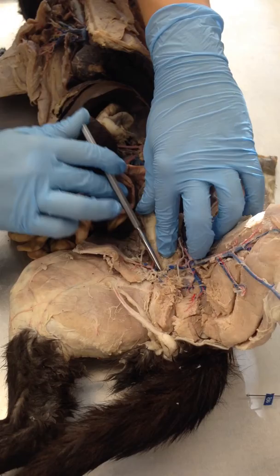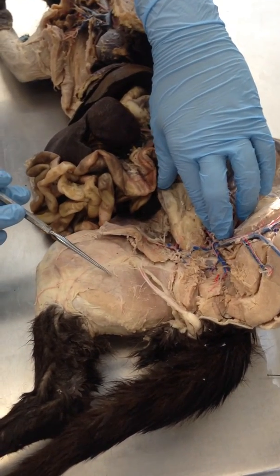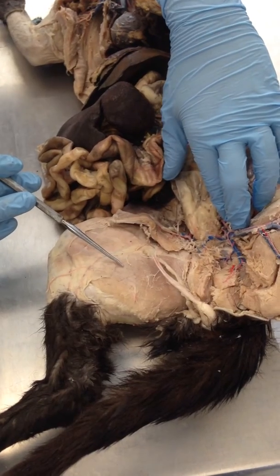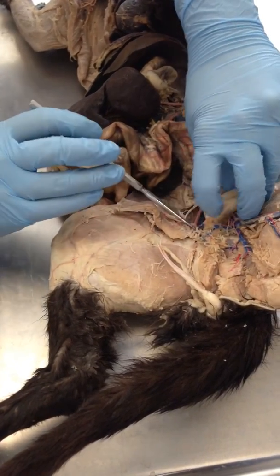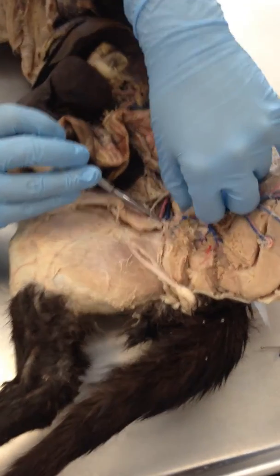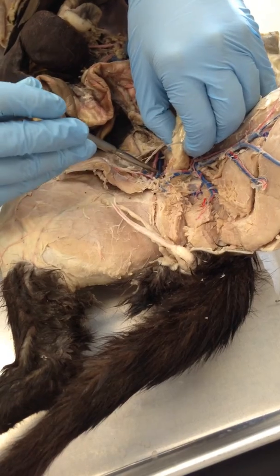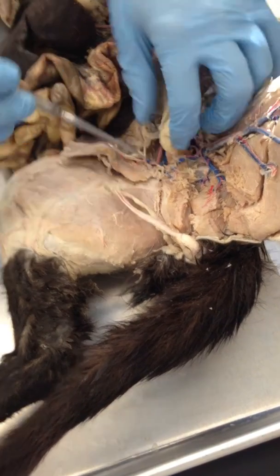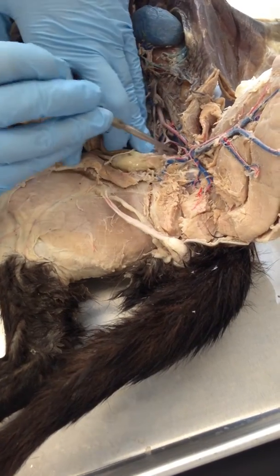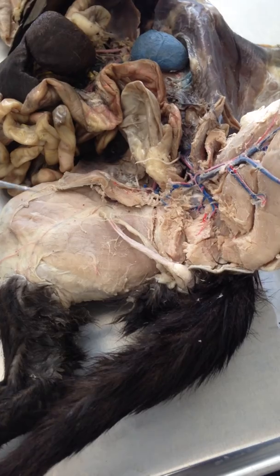Do we need to cut this open so we can see it? The only reason to cut that open on the male would be to find the prostate. The vas deferens attaches to the urethra where the prostate is. On some cats, if you push things around a little bit, you can see where they attach without splitting the pelvis. On some cats, you may have to split the pelvis to see the prostate. Okay. I'm looking for the prostate, but I guess I'll just have to go deeper.